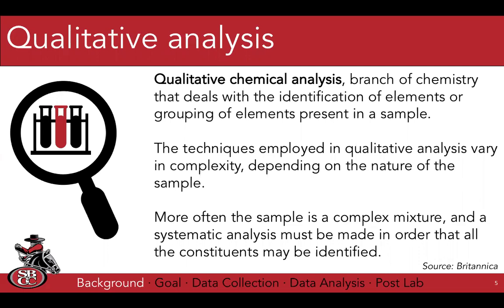But as soon as we put it into this instrument with a digital sensor, we had new opportunities available, and we could calibrate it, make a calibration curve, and then not just find out what is there, what wavelength we're seeing being absorbed by this sample, but we can go one step further and say how much is there, which becomes quantitative analysis. So keep in mind that qualitative analysis happens mostly when the viewer is the sensor. And that sensor has to be calibrated.